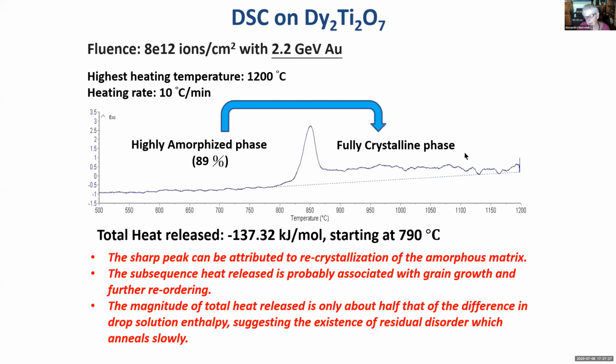So clearly then, the sample, after it's been heated to 1,000 degrees or even 1,200 degrees C, although to laboratory X-ray it looks like pyrochlor, something else is basically going on in the material. And we don't know, if we were to anneal it for months, whether it would go all the way back. Now, the exciting part comes from the neutron studies.